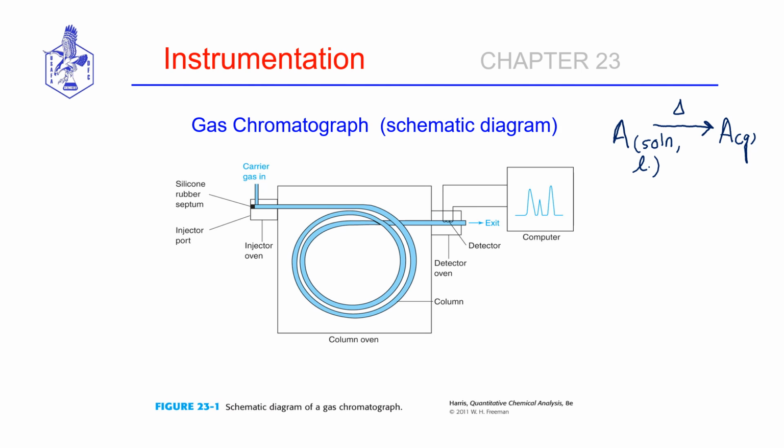Typically, if you can separate a sample and have the choice of GC versus HPLC, GC is preferred for two primary reasons. First of all, it's a simpler technique to optimize all of the parameters you need to get an effective separation, clean resolution in the least amount of time. It also does not generate waste in the form of organic solvents that have to be either regenerated or disposed of.